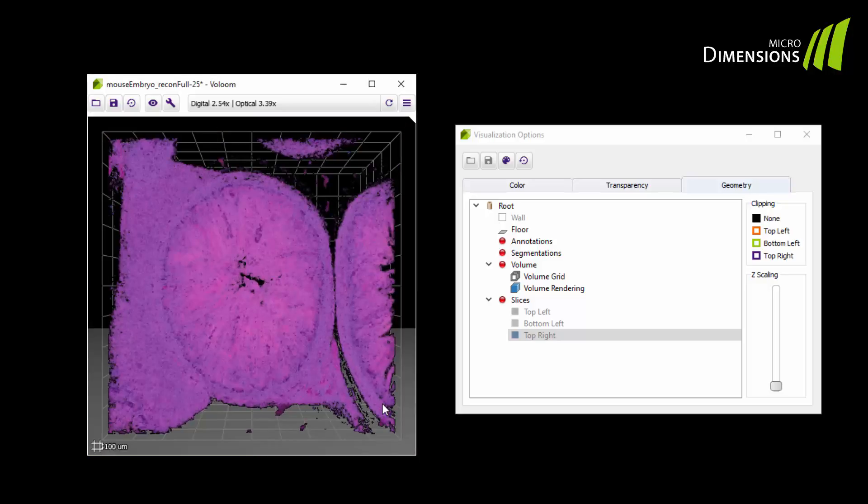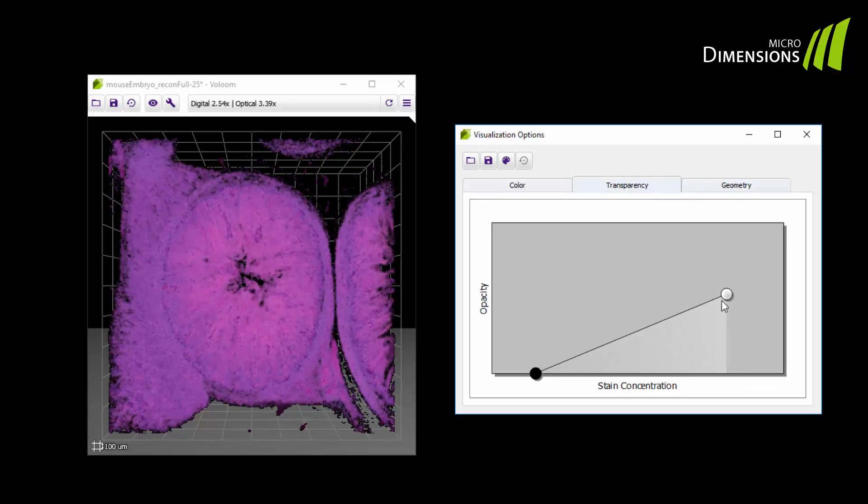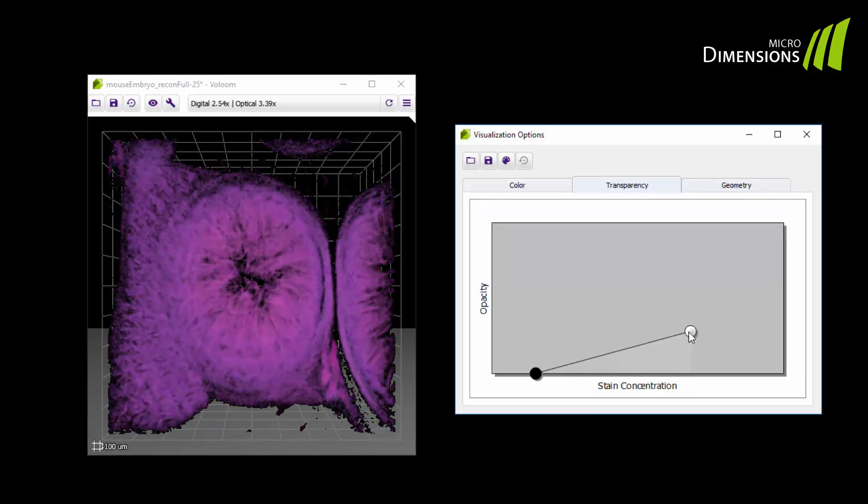In the transparency tab you can control the opacity and the intensity of the volume. Dragging on the knobs changes opacity and intensity.